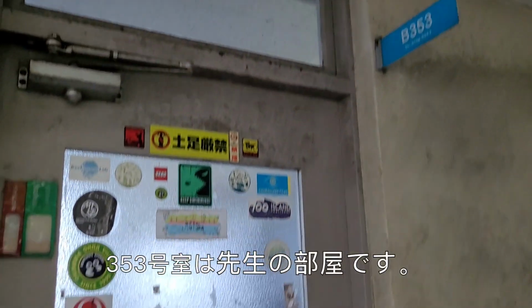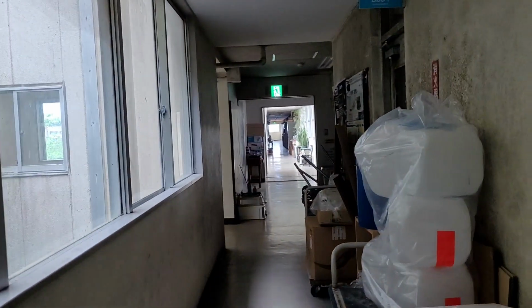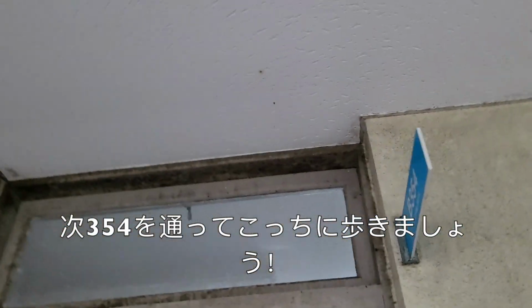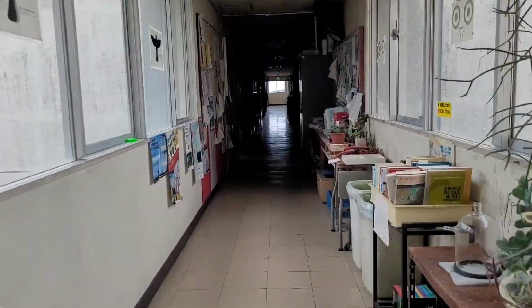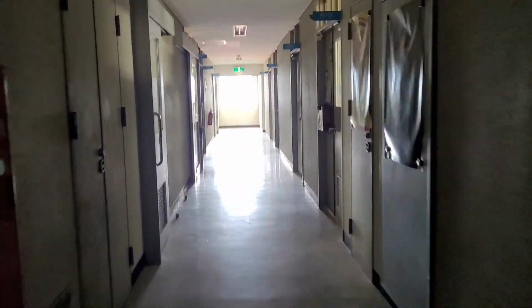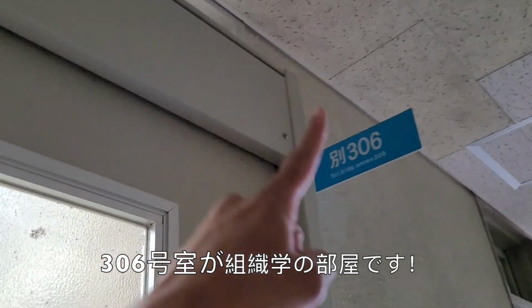So from Sensei's room right here, we're going to show you first how to get there. Sensei's room is here in 353. Then you want to go this way, past the molecular room, 354. This is the histology room, 306.